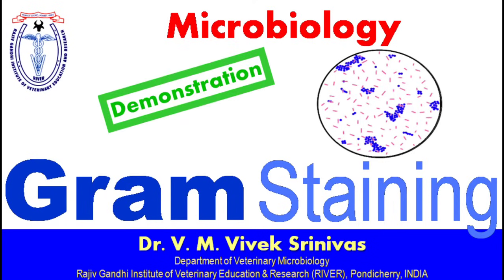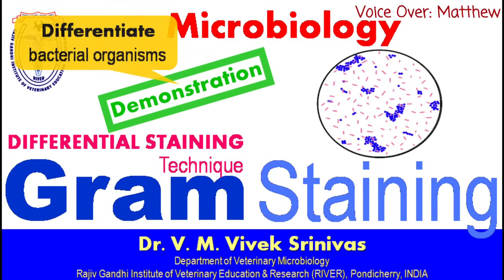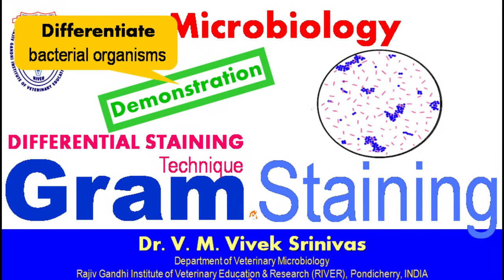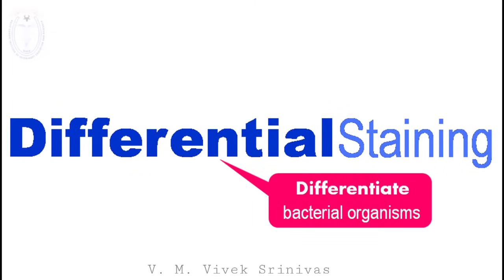In this video demonstration, we will see about a differential bacterial staining technique, Gram staining. This protocol is used to differentiate and classify the bacterial organisms into two large groups. The differential bacterial staining technique is used to differentiate the bacterial organisms.